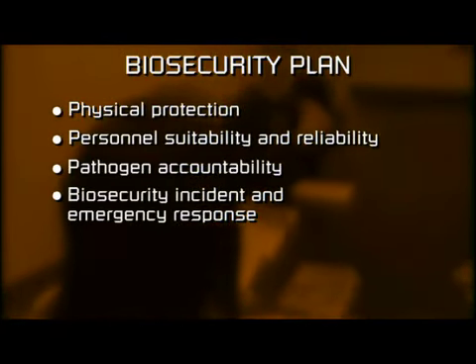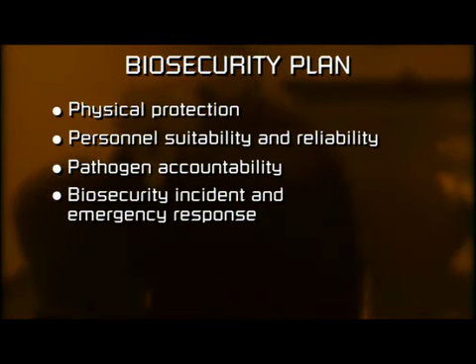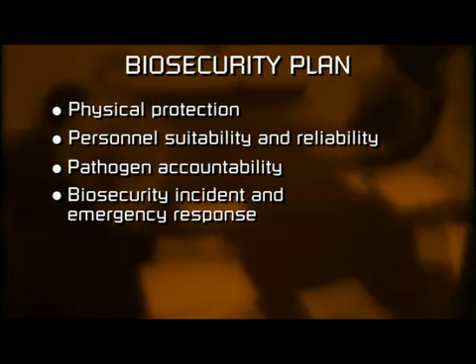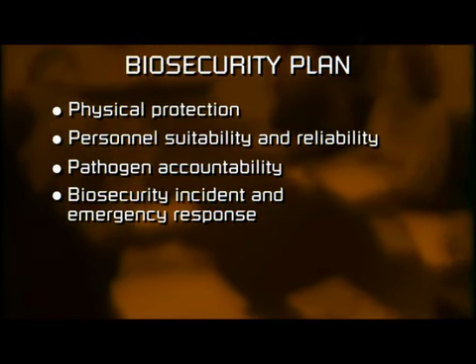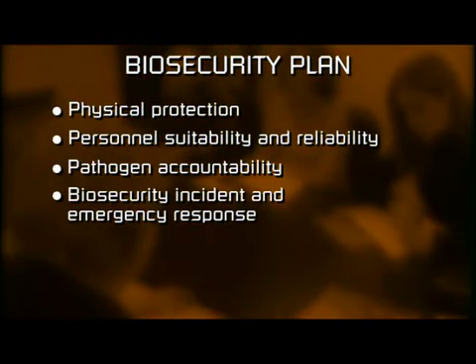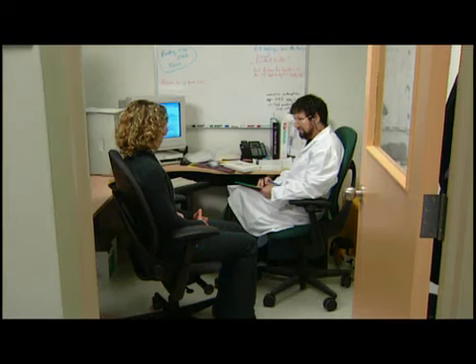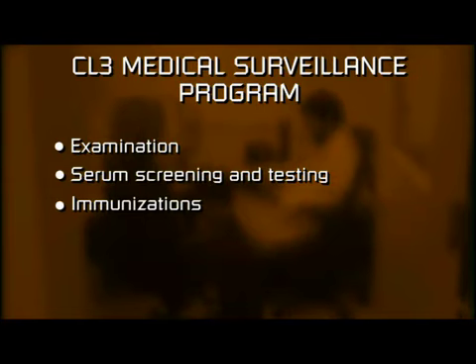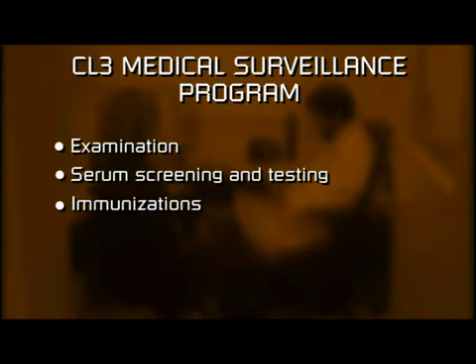Facilities handling infectious agents need not only a biosafety program, but also a biosecurity plan in place. A responsible official can be assigned to develop, train, and implement the safety, security, and emergency response plans. As part of Containment Level 3 lab safety concerns, a health and medical surveillance program needs to be appropriate to the agents handled in that lab. Only people meeting the medical requirements may enter the laboratory.